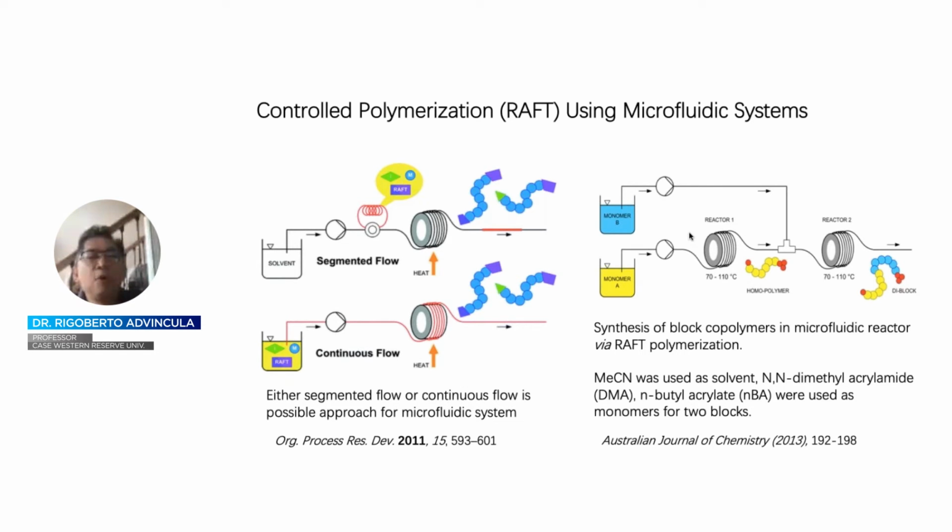Other types of flow could be pulse control, continuous flow, and of course the parameters of temperature and pressure. And as I'll show you later, in a simple free radical polymerization, or living free radical polymerization, the use of lower temperature or higher temperature control gives an important addition towards the control of the molecular weight as well as yield.